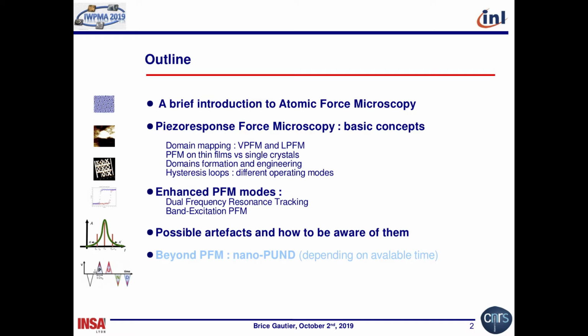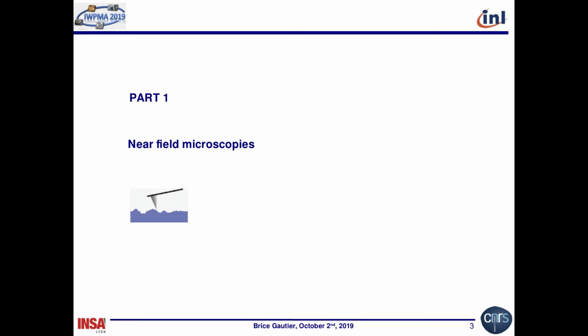If I have time, I will describe a purely electrical method which is based on current measurements by AFM, which helps you distinguish between true ferroelectrics and the fake ferroelectrics. So, let's start with the first part. Near field microscopy. This is a very short section, just to be sure that everyone in this room makes a clear difference between the contact mode of the AFM, the tapping mode, the non-contact mode, and intermediate mode.